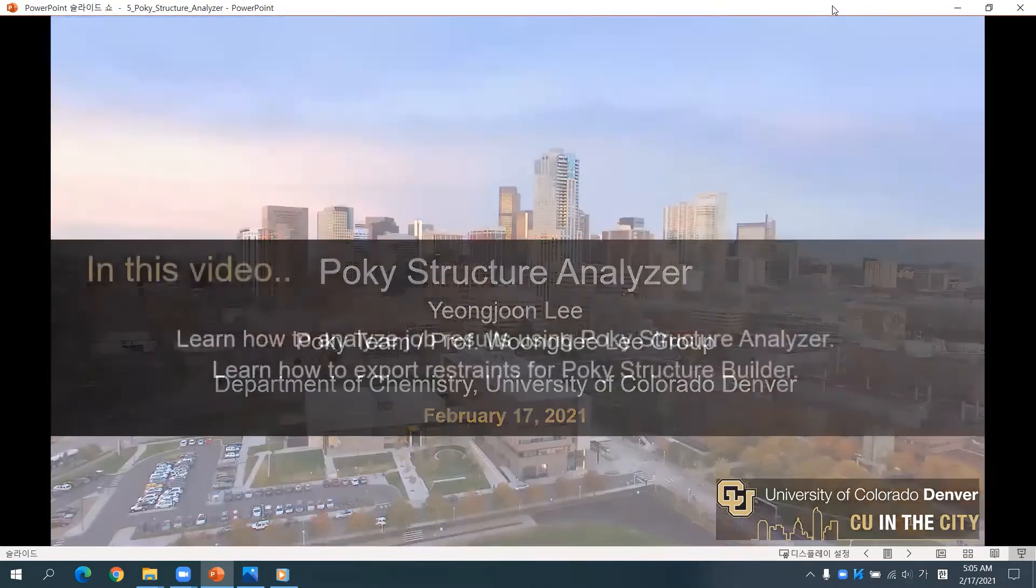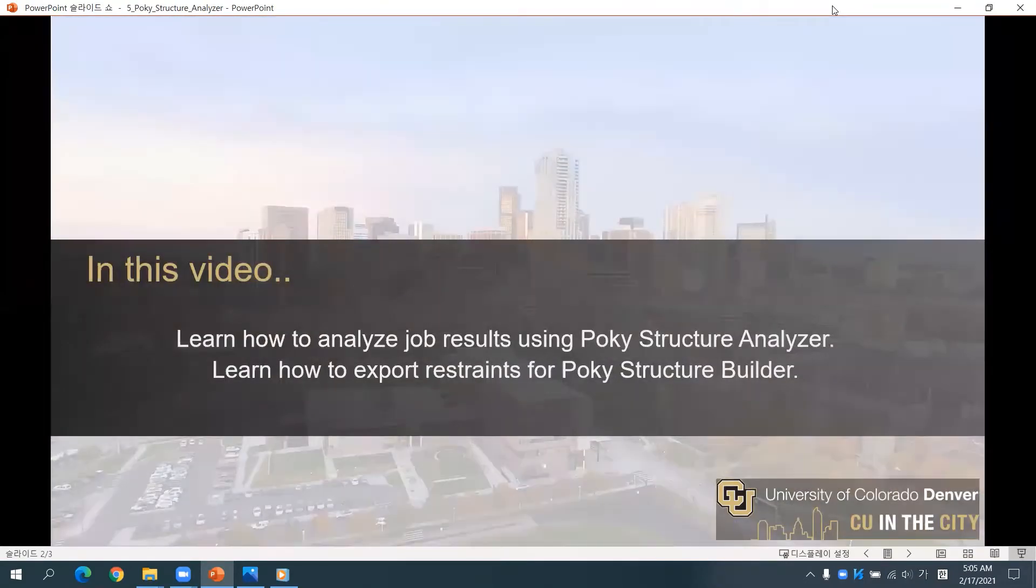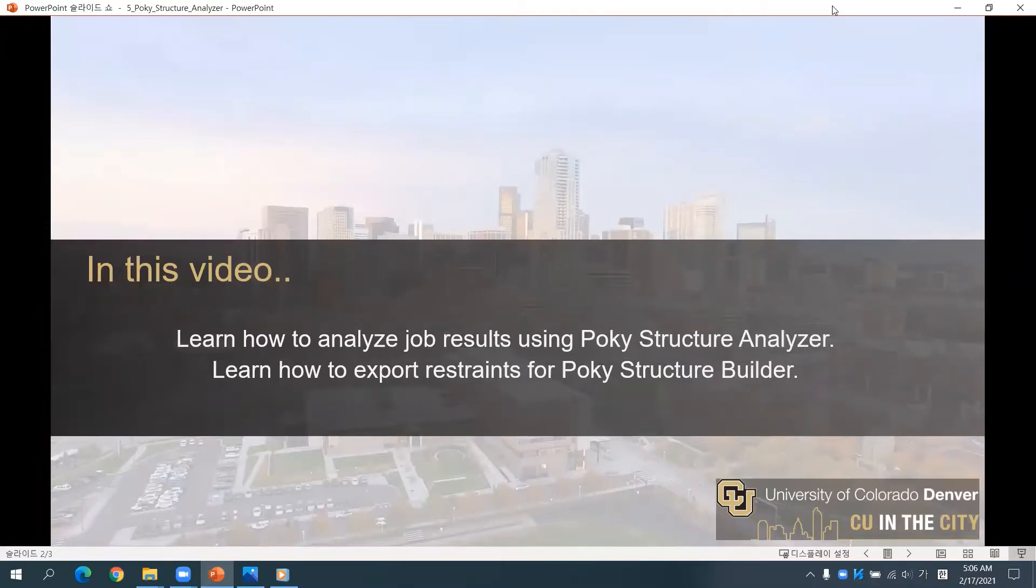In this video, you will learn how to analyze job results using Poky Structure Analyzer. Also, you will learn how to export restraints for Poky Structure Builder.